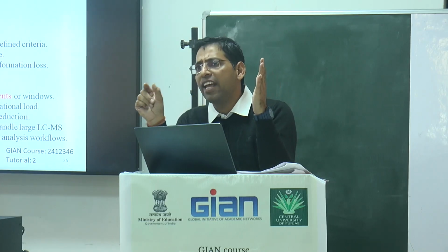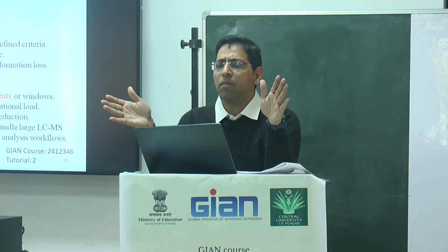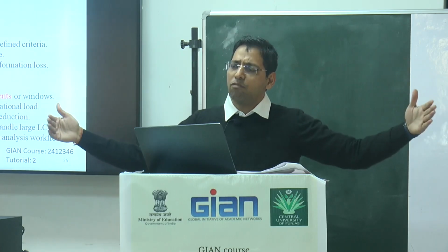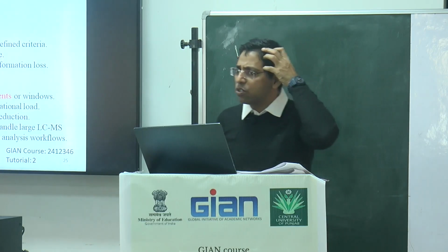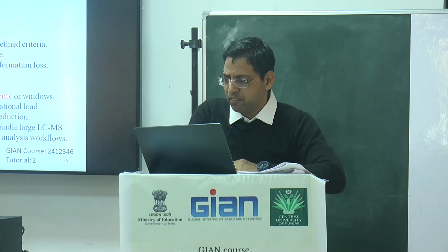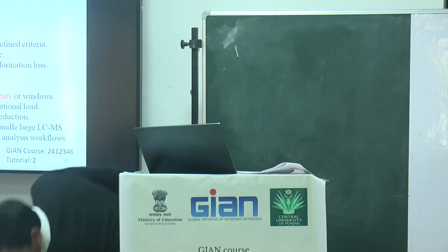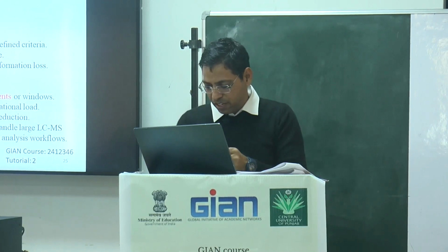So you have to fix the area, small house. When you have a big house, you first of all do the painting in one room, then another room, then another room. So we divide the whole spectra into small sectors, bins actually. So they reduce the dimensions by average and the summation of intensity within each bin, balancing data reduction and information preservation also. I will come back to this binning in the next slide also for the picture illustration.